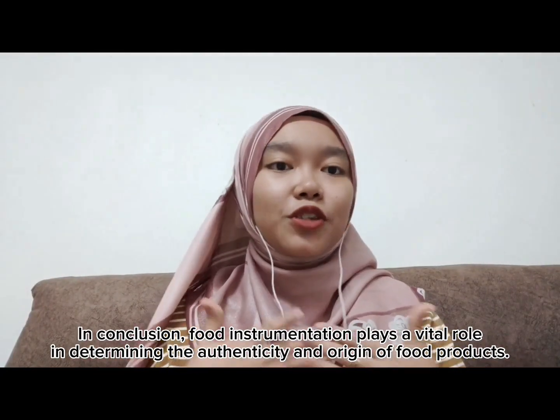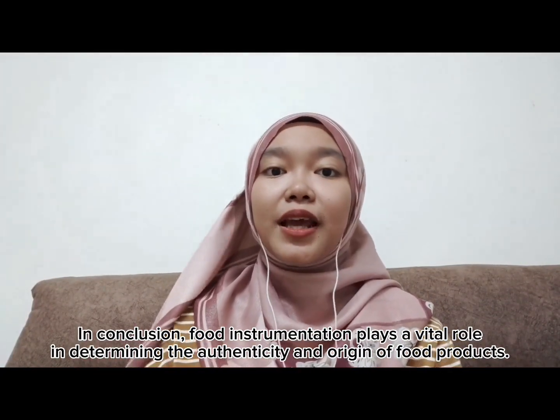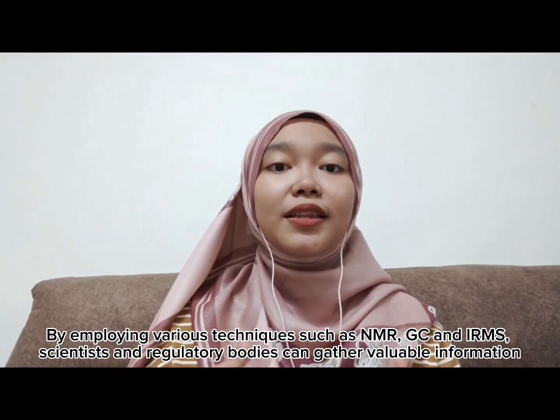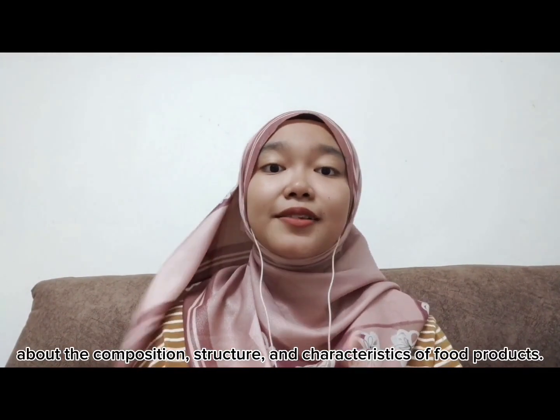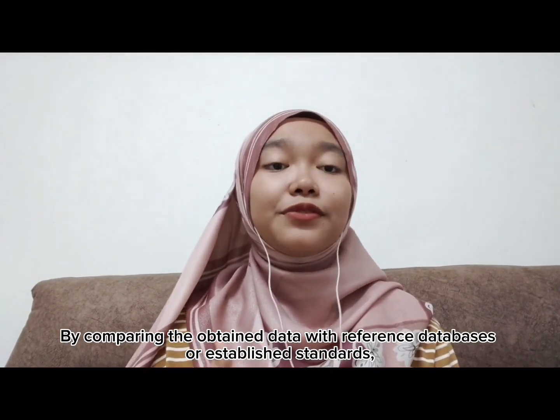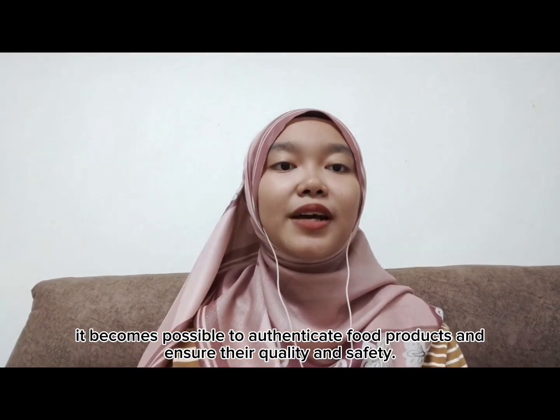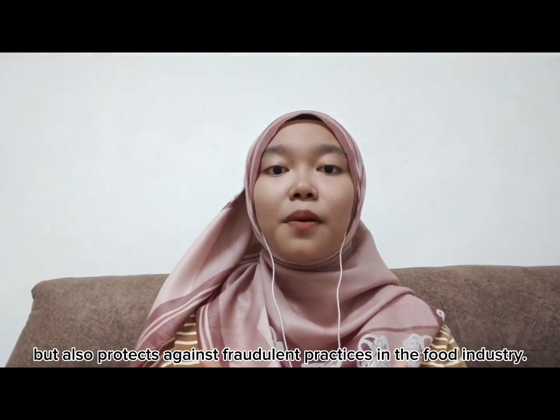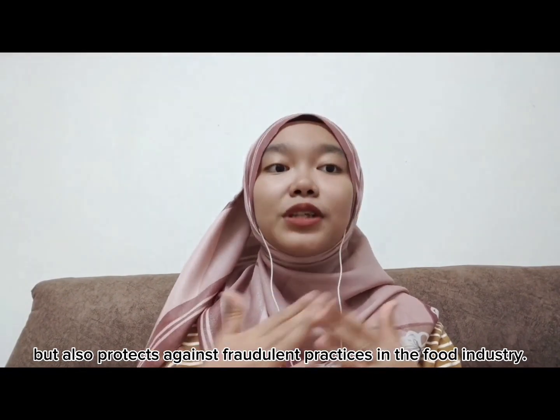In conclusion, food instrumentation plays a vital role in determining the authenticity and origin of the product. By employing various techniques such as NMR, GC, and IRMS, scientists and regulatory bodies can gather valuable information about the composition, structure, and characteristics of the product. By comparing the obtained data with reference databases or established standards, it becomes possible to authenticate food products and ensure their quality and safety. The use of food instrumentation not only helps in safeguarding consumers' health, but also protects against fraudulent practices in the food industry.